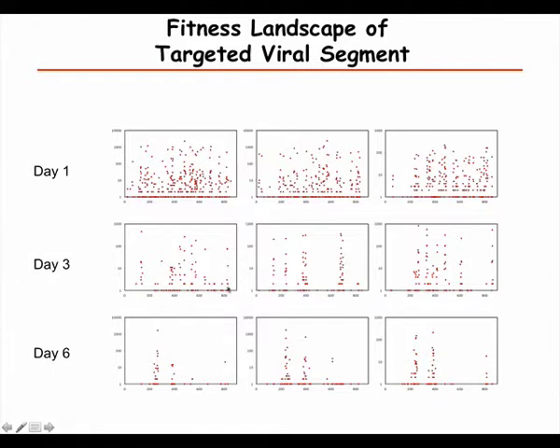So we see what happened. These are three experiments, and at day 1 there are already much fewer. A lot of them fall out immediately, depending on where the insertion is. But after a few days, there are really only 2 positions where insertion is tolerated. So in all these 3, it ends up being the same.